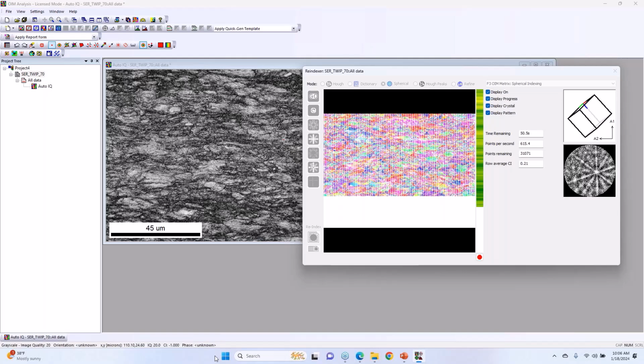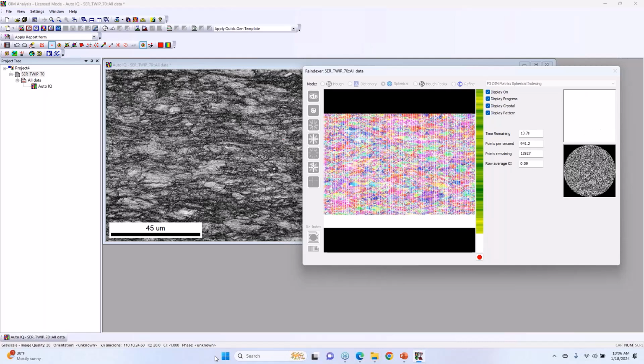Yes, you can run through and save the patterns and then export them as a saved pattern set. That's why you can use that reassociate pattern file option. Conceivably you could do NPAR, then NPAR again, and then NPAR again, to play with that. But yes, you can do that.